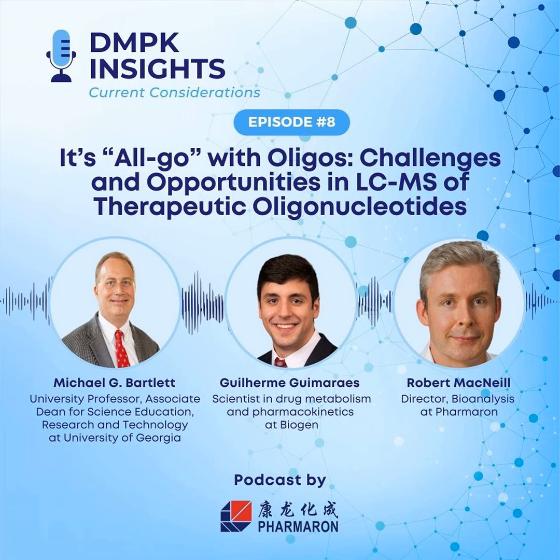I think one of the biggest challenges, at least as I see it more as an academic, because these things matter a lot more to me, is that because there aren't as many competitors in the oligo SPE area, the cost for the SPE oligo plates and SPE cartridges is much higher than other ones. So from my perspective, I would like to see a supply and demand correction there. We definitely need to get more people into the field for that because it's quite pricey to do SPE of oligos.